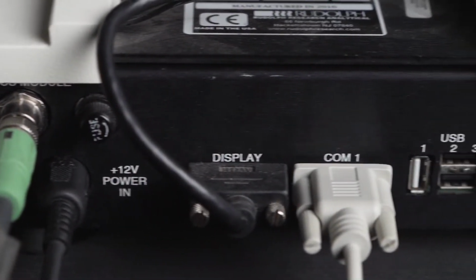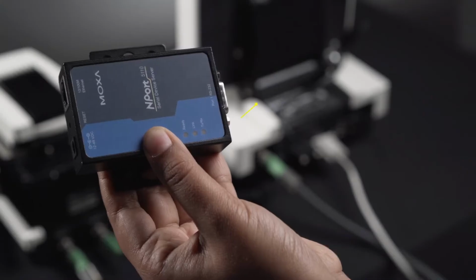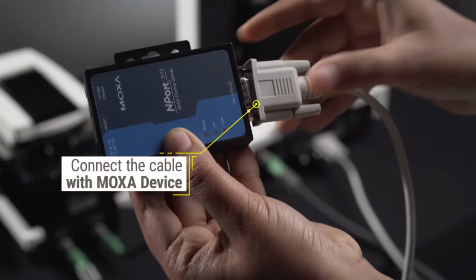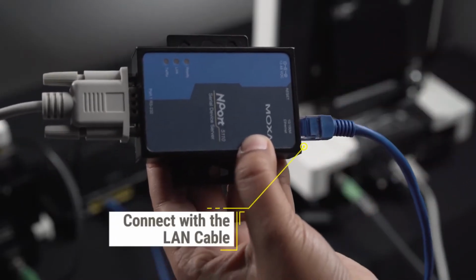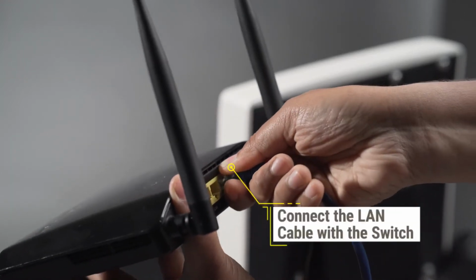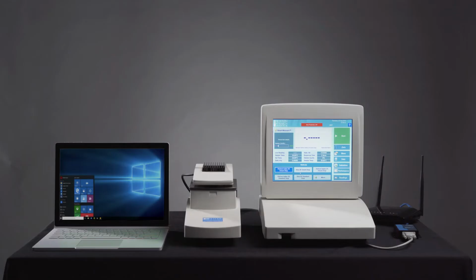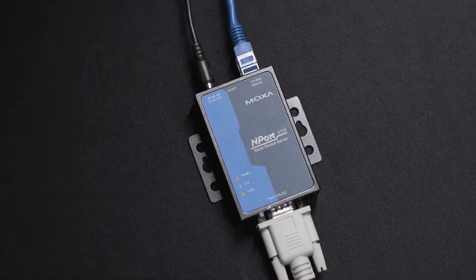The other end of the cable goes to the MOXA device, as we will be using the MOXA device to convert the RS-232 port to a network port. Connect the MOXA device with a network cable. Plug the network cable in the network slot. Once this is done, we will be covering the section of connecting the MOXA device configurations in a separate video.